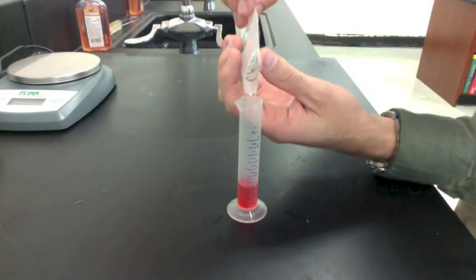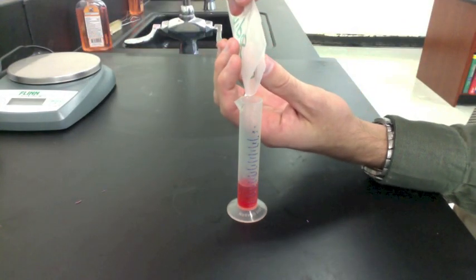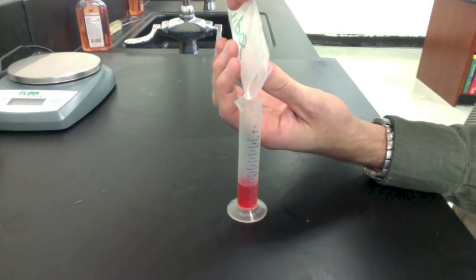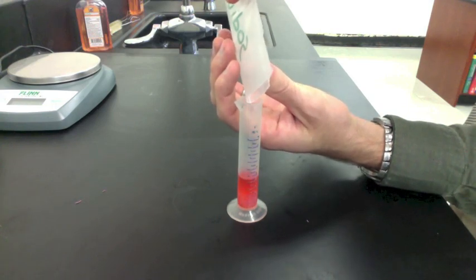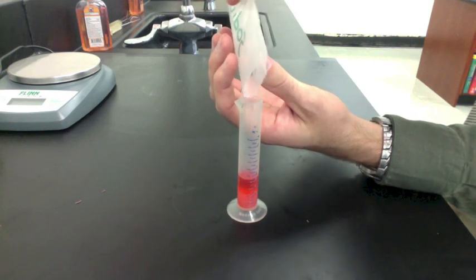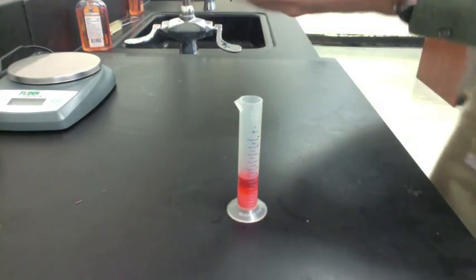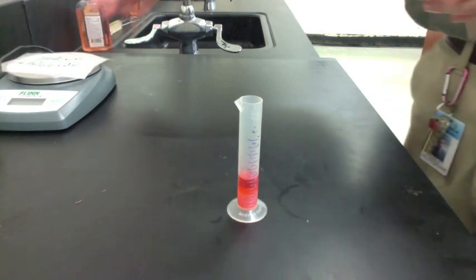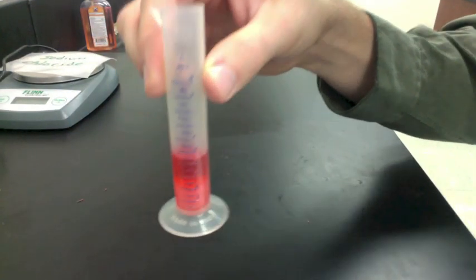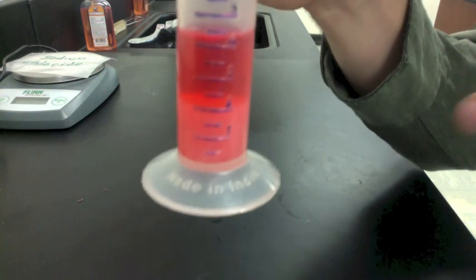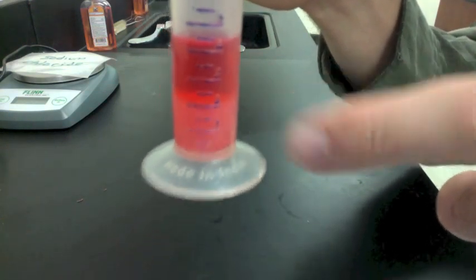Now we can add in the powdered solid, which is sodium chloride. Remember, sodium chloride is insoluble in ethyl alcohol. That means it does not dissolve. You can actually see the sodium chloride at the bottom. It is not dissolved.